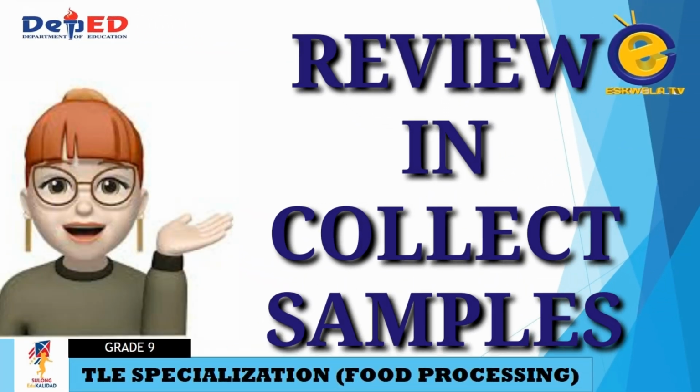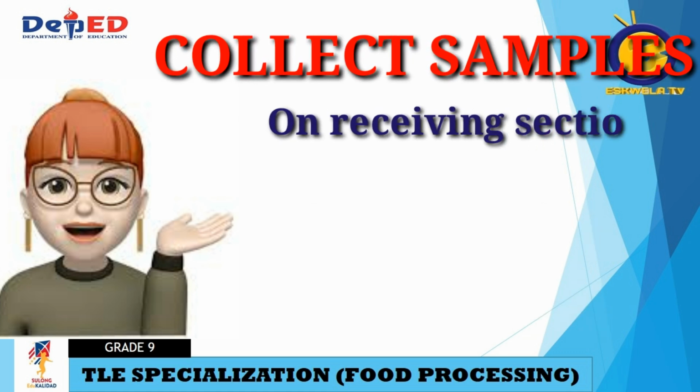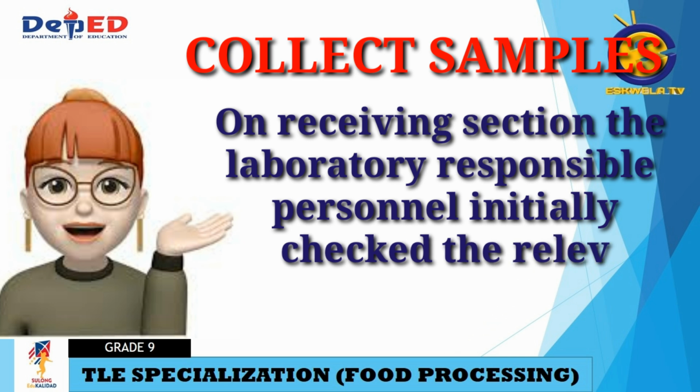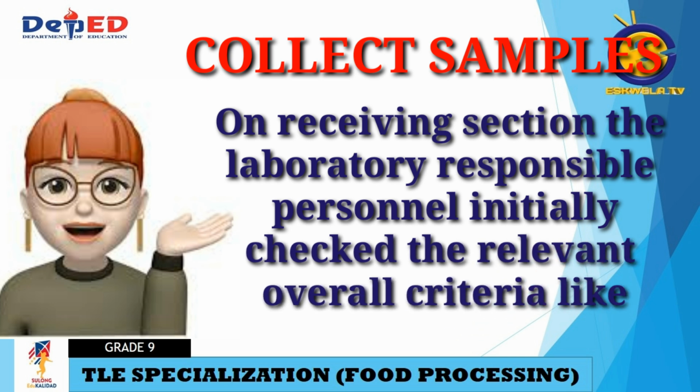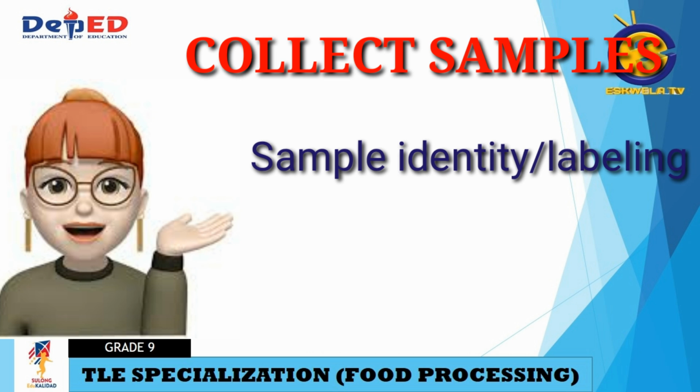Last week, we discussed collecting and transferring samples under controlled conditions. All incoming samples are received through the receiving section, maintained and supervised by the laboratory responsible person. In the receiving section, the laboratory's responsible personnel initially check relevant overall criteria like sample identity or labeling.